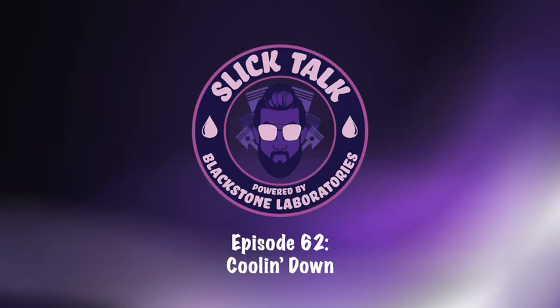And I want to pause right there just to let you know that if you send us a sample of coolant, or if you're sending us a sample of really anything that we can analyze and you haven't changed it yet, if you make that explicit, we'll be sure to mention whether or not it should stay in use. But if it's an instance like coolant where we aren't quite sure whether or not you've changed it, we'll still be sure to offer a recommendation, because you don't want to leave coolant in use if it's not serviceable for any variety of factors. The issue with this particular sample was the freeze point.